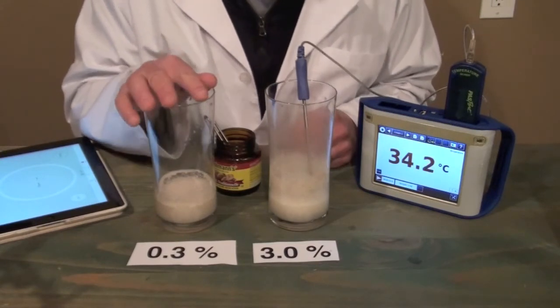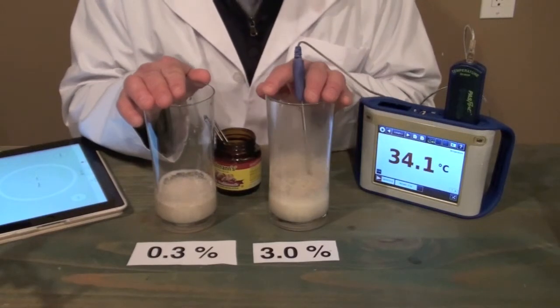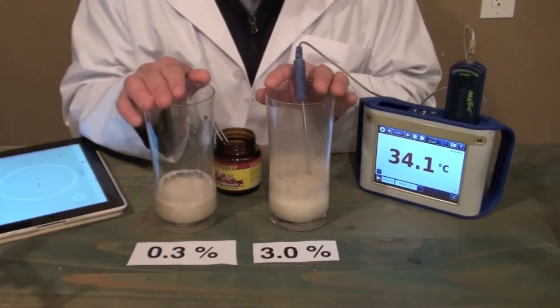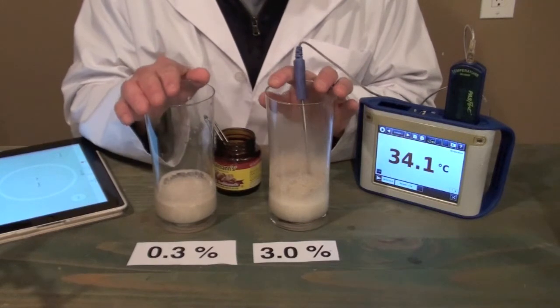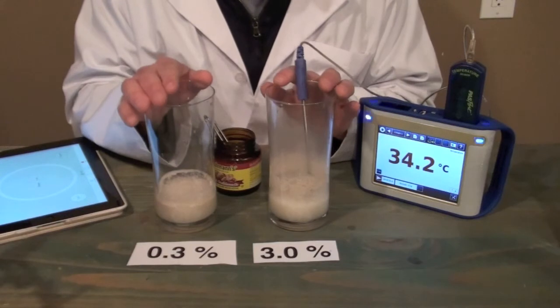So in conclusion, it seems that a higher concentration of solution will result in a much more vigorous decomposition reaction when a catalyst is added.